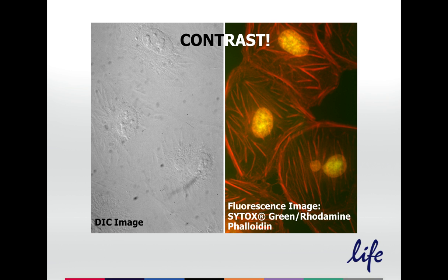The old-fashioned way was to use colored dyes that don't fluoresce, like hematoxylin and eosin, especially for tissues. But a better method is to use fluorescence. As you can see in the image here, you get much better signal to background because you have a black background. And you're able, using filters, to select only the dye of interest, and that gives you better ability to multiplex, to add multiple different labels on the same sample and view them together.